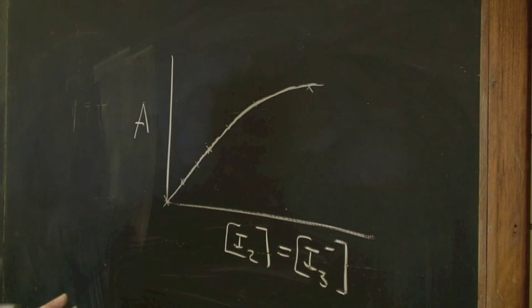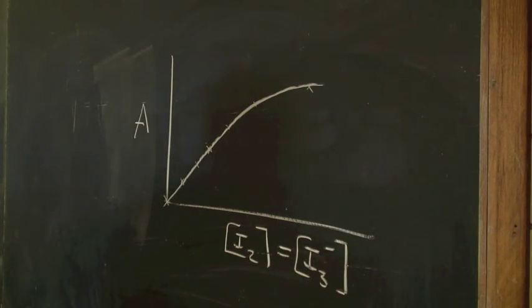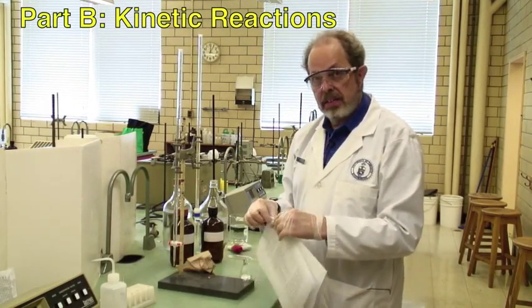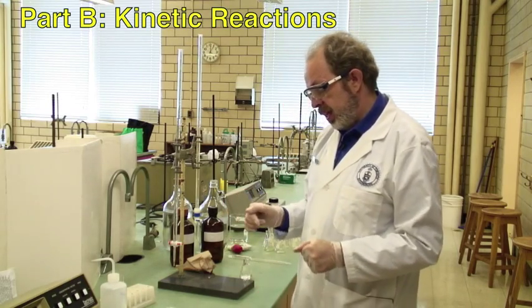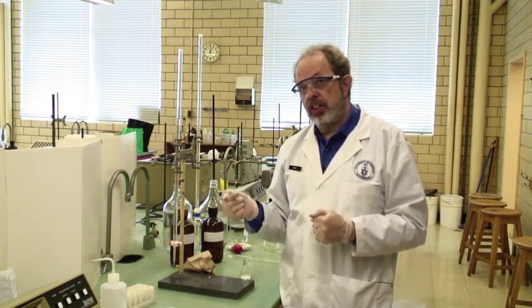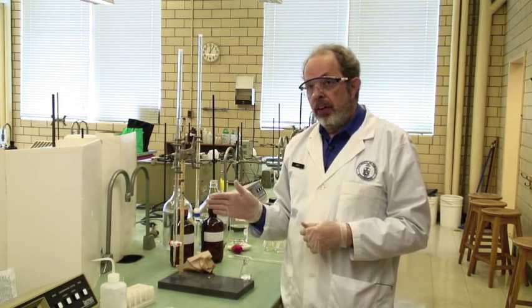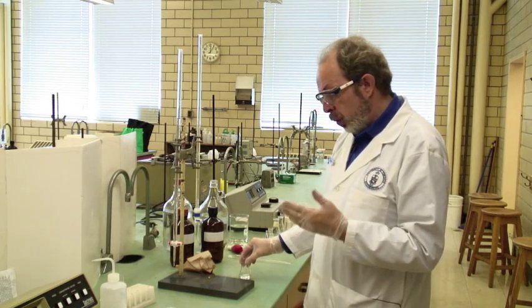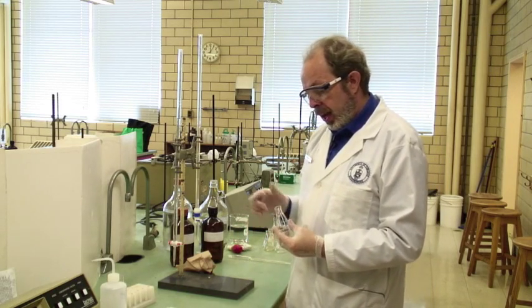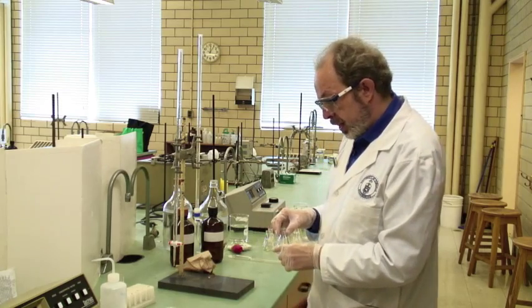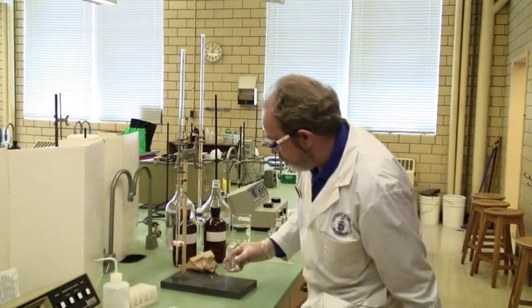Once we've got the calibration curve ready — which will translate absorbance into actual concentration of iodine produced — we're ready to run the actual reactions. You're going to be running six reactions: A, B, C, D, E, F. In the first series, A, B, C, you'll be changing the initial concentration of iodide while keeping the concentration of peroxydisulfate constant. You'll also have distilled water and potassium nitrate in there to maintain a constant total volume. I've got the distilled water and potassium nitrate in there now, and I'm going to dispense six mils of iodide.